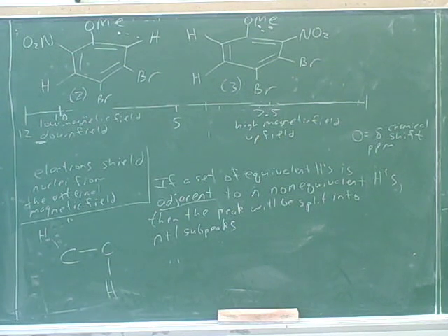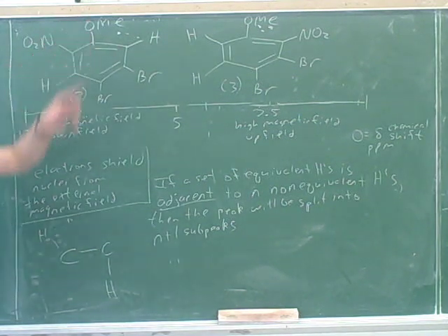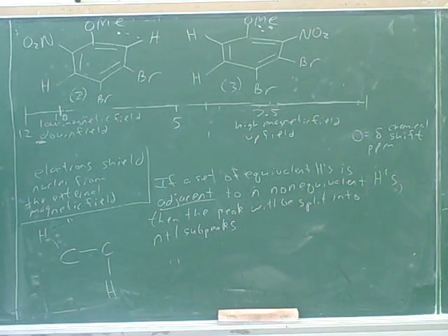2. 3. Where's the third one coming from? The methyl group. That's right. It's easy to forget the methyl group. So that would give us 3 different peaks. Now, how can we tell which are the peaks from these hydrogens and which are the peaks from the methyl? There's going to be a higher peak for the methyl group, because there's 3 hydrogens. Yeah.